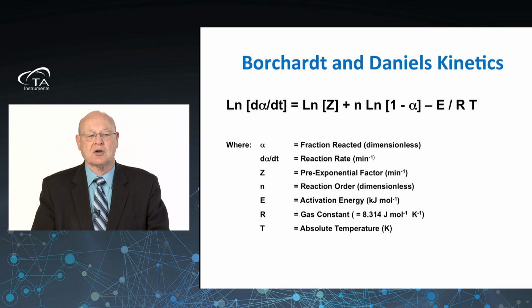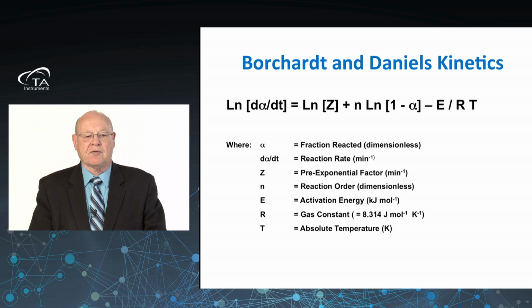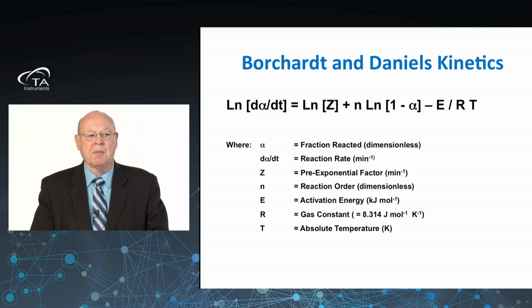Now, these equations look really complex and cumbersome. They can be, but of course, software available from TA Instruments will make these determinations for you very easily, but they're not all that difficult to perform by hand as well.